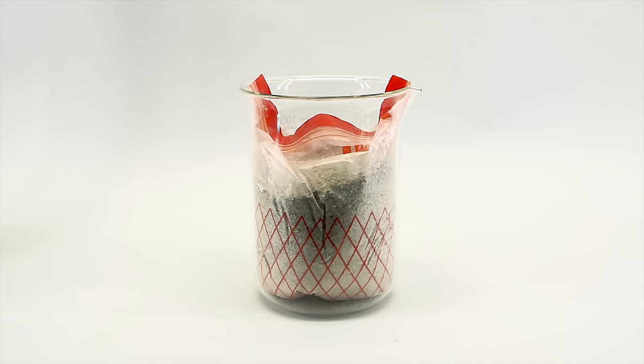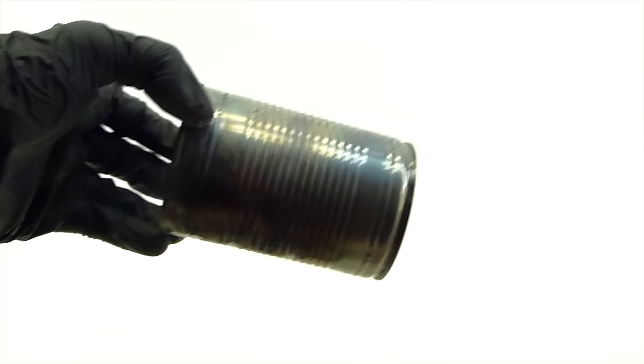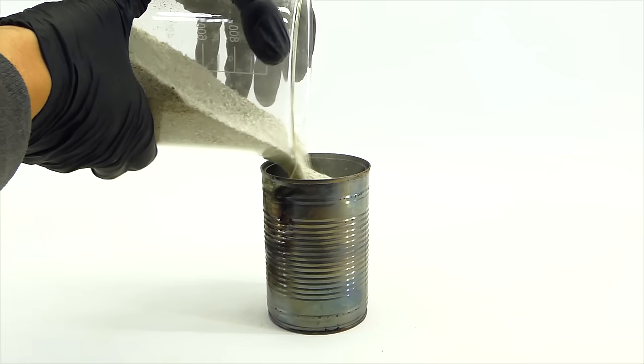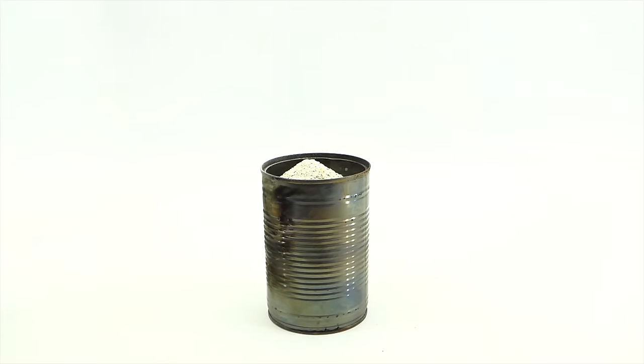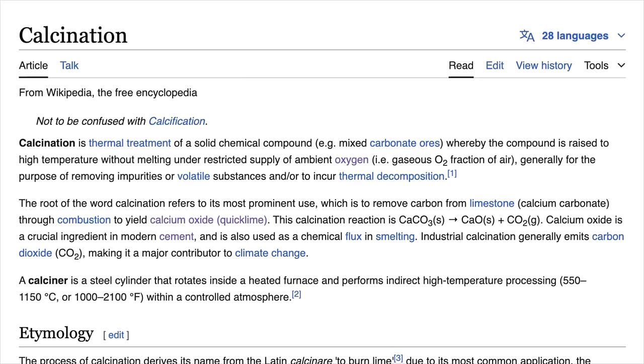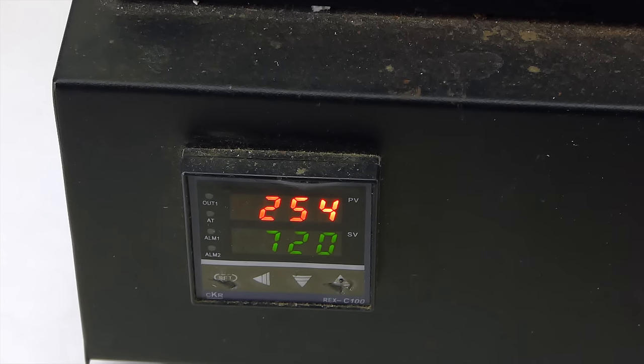For the incineration step, I figured I would load the eggshell powder into a cat food can and get it into my good old electric furnace. I couldn't fit all the powder into a single can, so I'd have to do two runs. With the can now nicely in the furnace, I turned on the heating and waited. The process I'm carrying out here is calcination — a simple thermal decomposition making carbon dioxide escape out of calcium carbonate, turning it into calcium oxide. It occurs best at around 1000°C; however, I first set the temperature a little lower to burn away all residual organic matter.